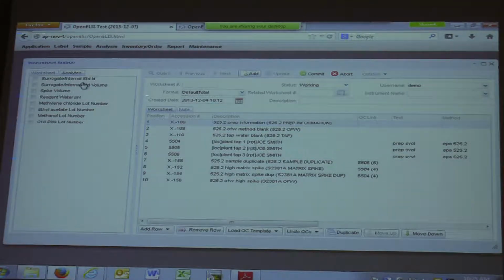Since you're in add/update mode, it shows you all the possible analytes for that test. If you were in just query mode, you're just looking at the record, it shows the currently assigned ones, and whether they're marked reportable or not. Okay. So in the mode I'm in now, this checkbox is dead. There's no functionality to that checkbox. That's a reportable checkbox, right?